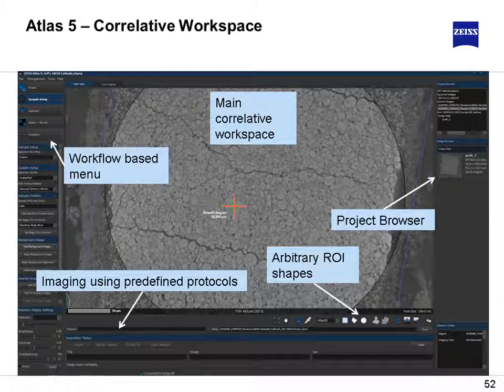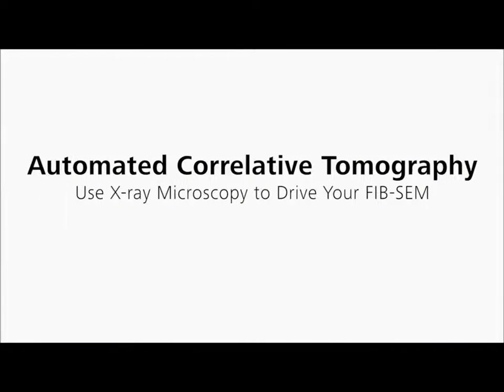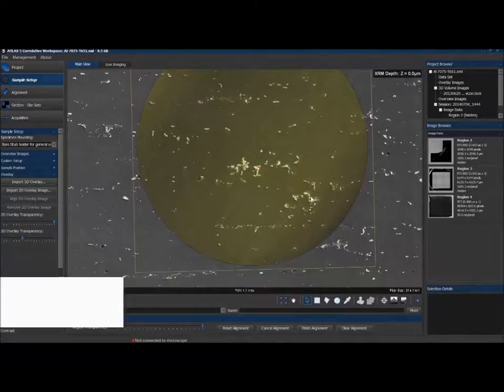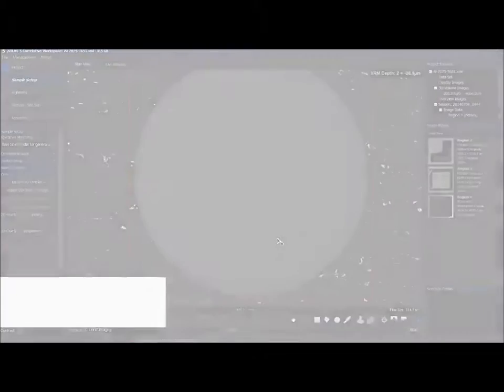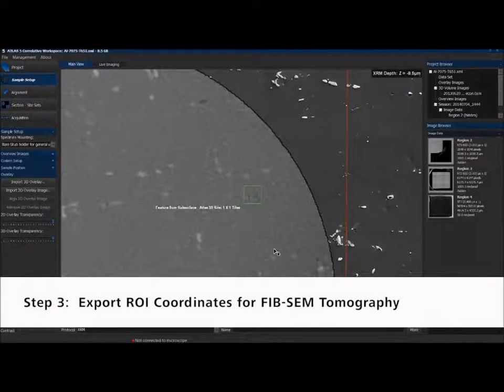And so in doing so, what I will do here is skip forward, as I see we're getting toward the end of the hour, and walk you through this one example, taking a quick diversion away from specifically a battery material. Here we're looking at an aluminum alloy, some work done in collaboration with Arizona State University, where we're similarly taking in a Versa data set here in yellow. And we're overlaying this with the 2D SEM image, and you see these bright features, they turn out to be heavy metal iron-based inclusions primarily.